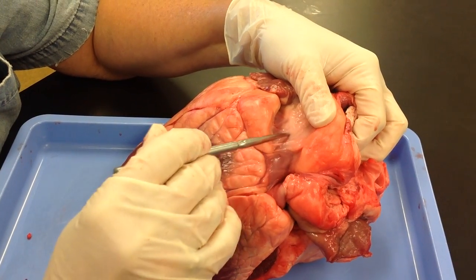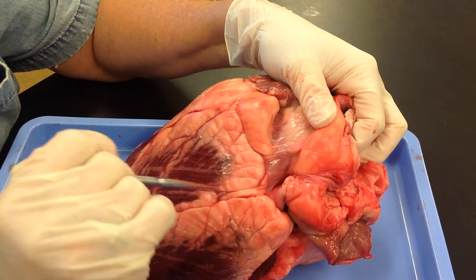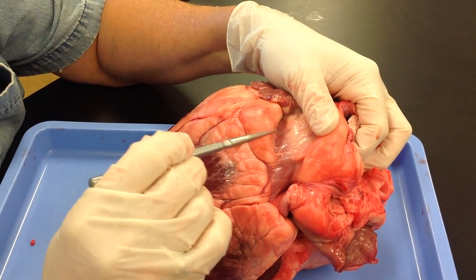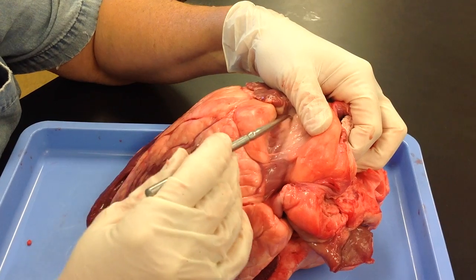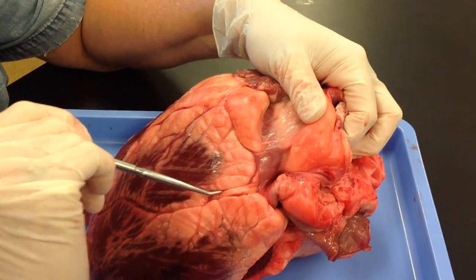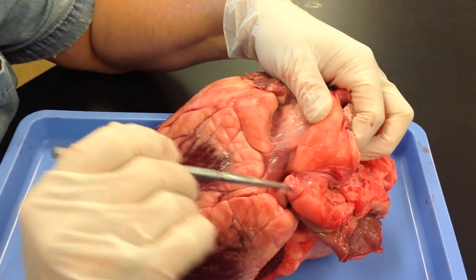If I had a pin here and said where was the blood before it was here, you would say cardiac veins. Where is the blood after it passes here — right atrium. The coronary sinus collects all the deoxygenated blood from the heart muscle itself and takes it to the right.